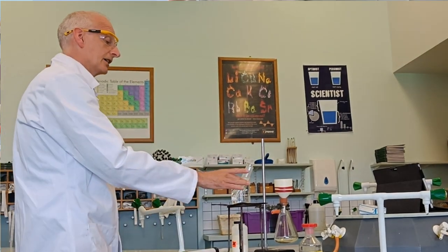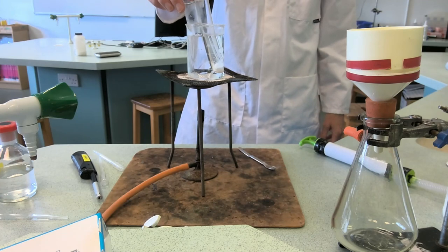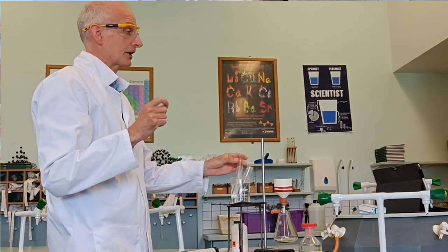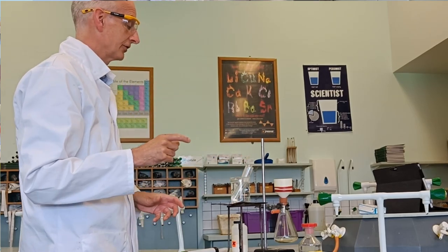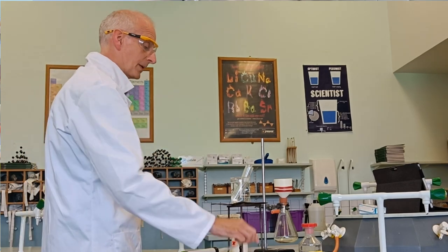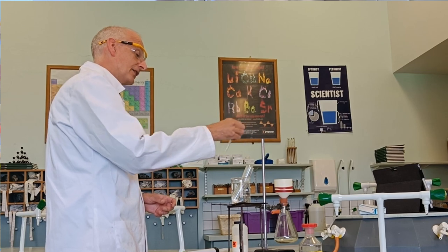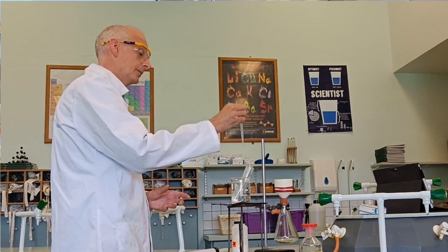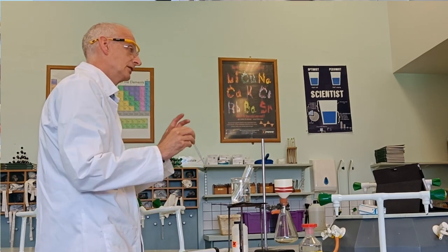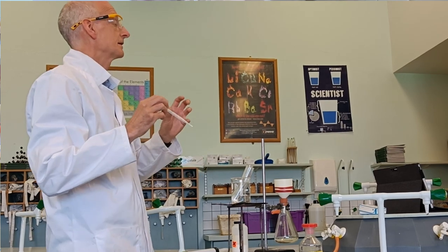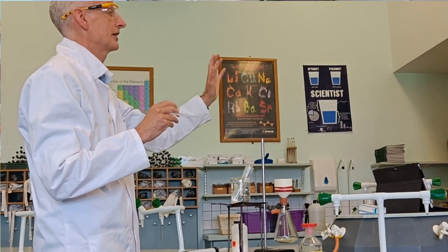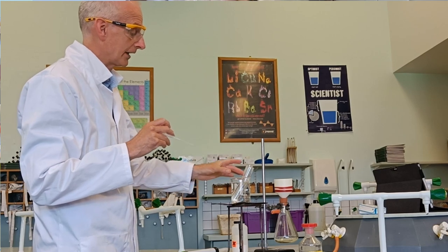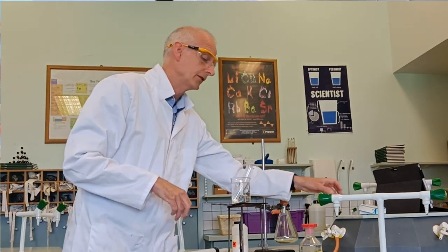The water bath is going to heat up both these things. The trick to recrystallization is I want to dissolve it in the minimum amount of hot solvent. I've got a pipette here, and when this gets nice and hot, I'm going to transfer from the solvent tube into the solid tube and keep doing that until the solid just dissolves. You can tell when something dissolves - it goes transparent. If it's cloudy, you've still got some solid particles.